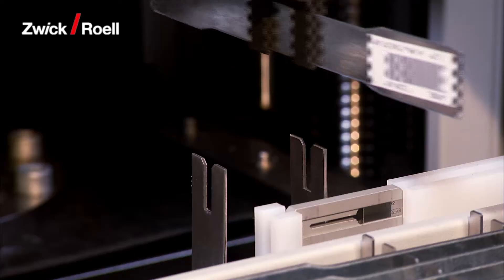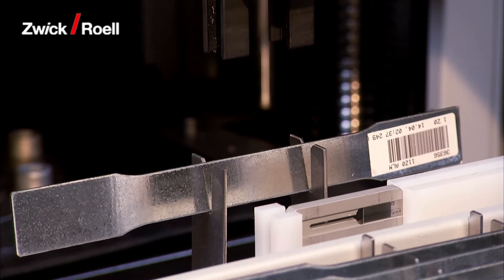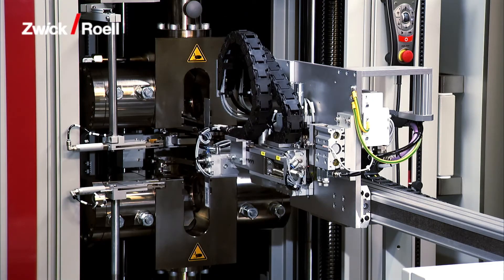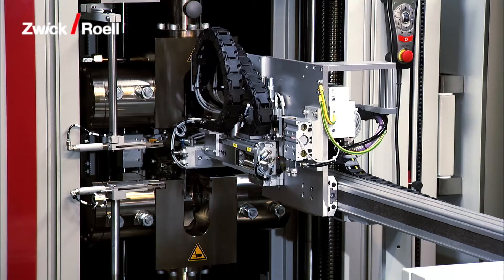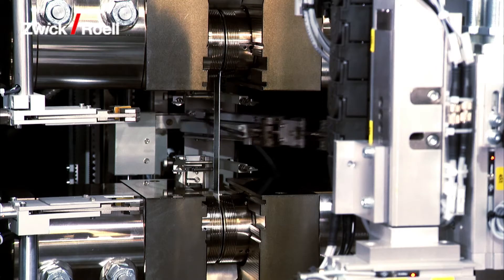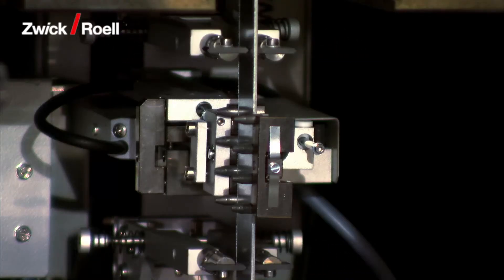The next stop is the buffer tray. The specimen is set down here so that it will then be perfectly aligned in the specimen grips. The specimen is then transferred to the tensile testing machine. First, the specimen grips close. The extensometer is then attached and the tensile test starts automatically.